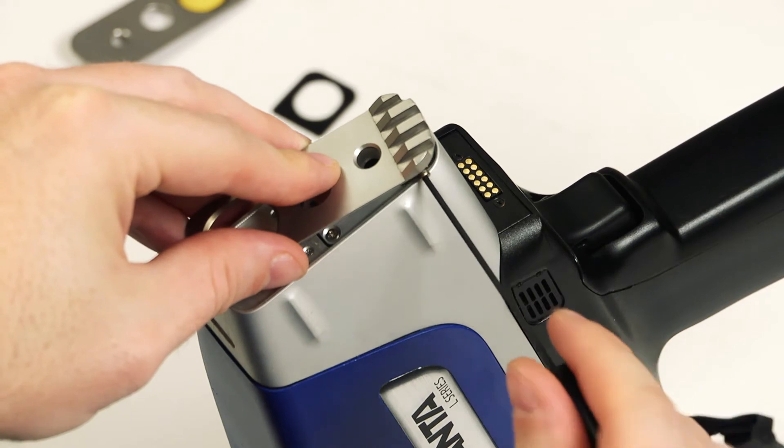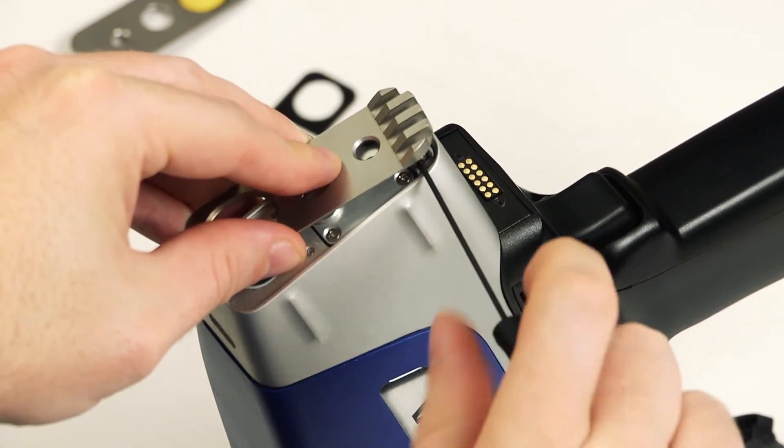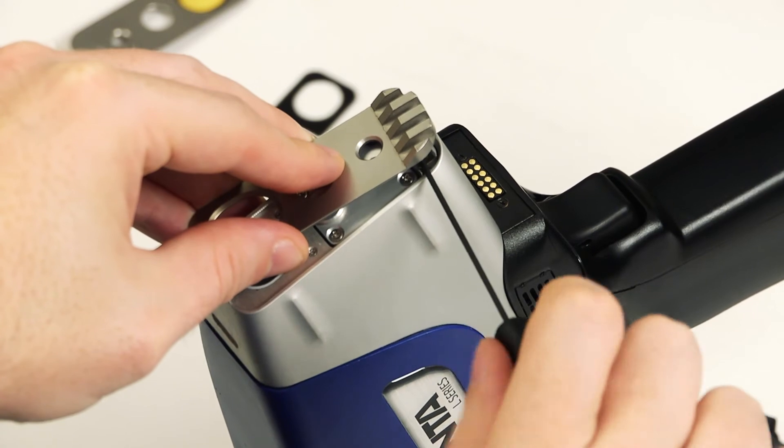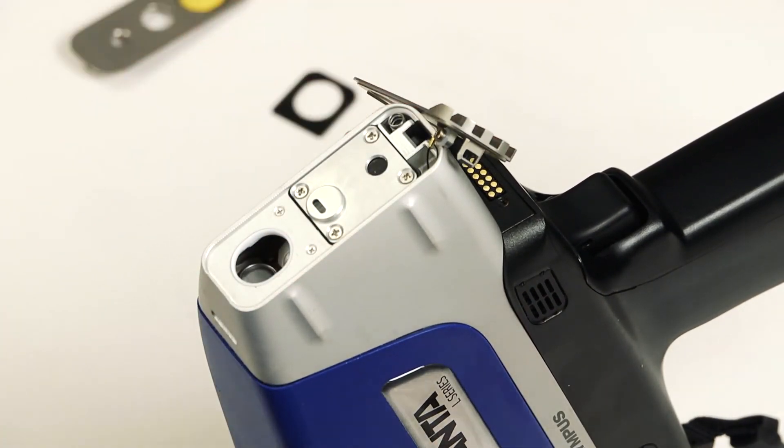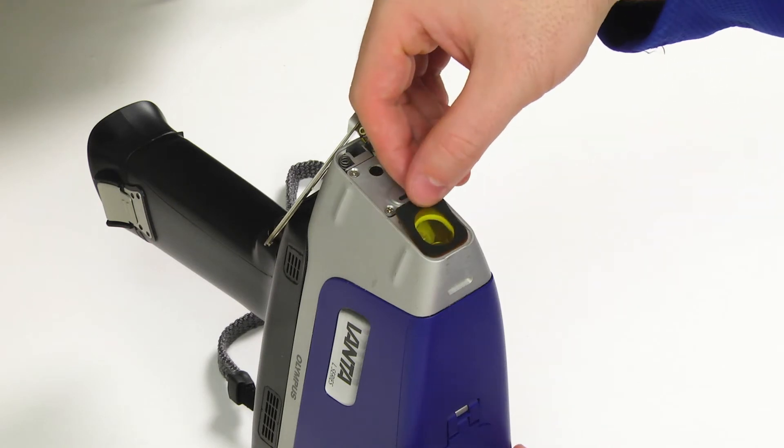Reattach the tether to the hot heel faceplate and hang it off to the side. Place the window and gasket on the analyzer with the window side down.